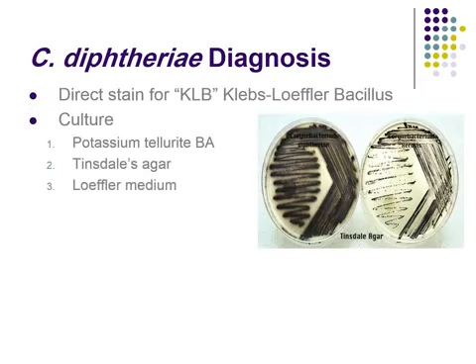The culture of bacteria is done by using special media such as potassium tellurite blood agar, Tinsdale agar, or Loeffler medium. So these are special media used to diagnose Corynebacterium diphtheriae: either potassium tellurite blood agar, Tinsdale agar, or Loeffler medium.